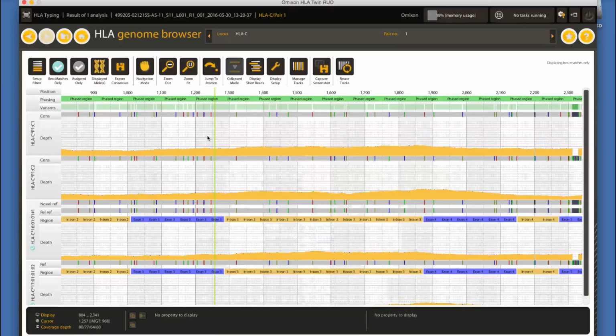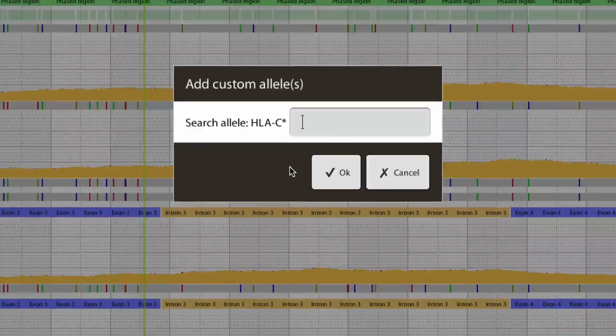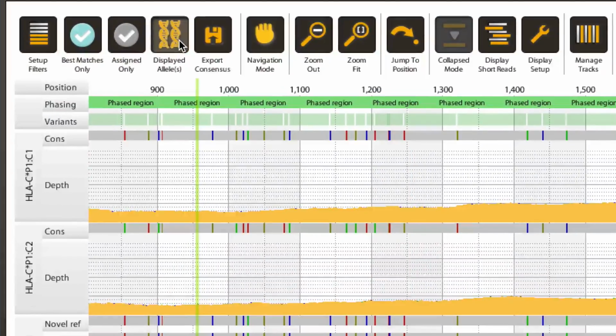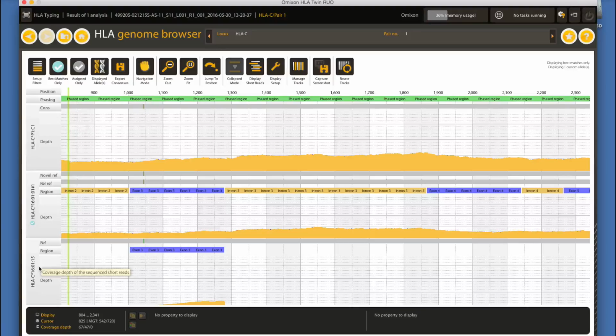We attempt to pick the closest match from the IMGT database in terms of biochemical functionality, and we also use it to name the novel allele. In case of class 1 loci, we pick the allele that is the most similar in key exons 2 and 3, and for the class 2 loci, the priority is to find the closest allele on exon 2.